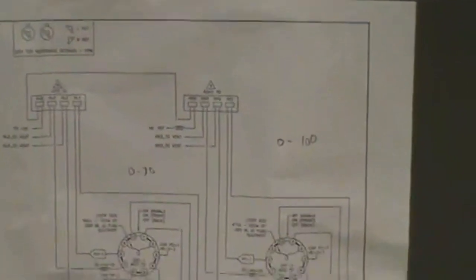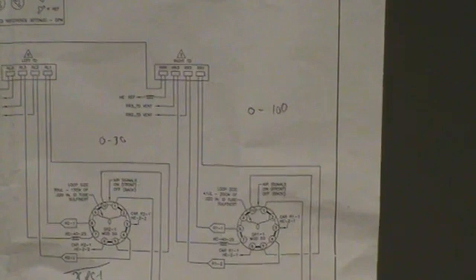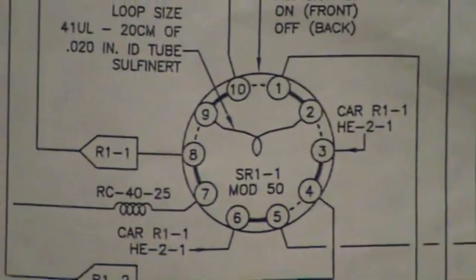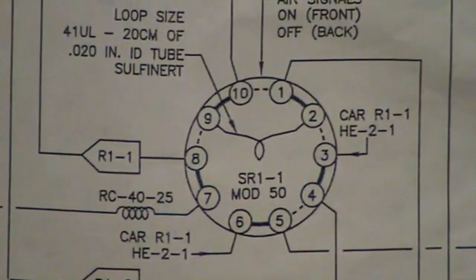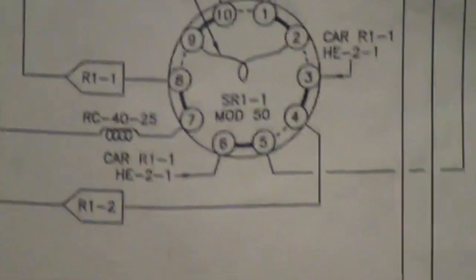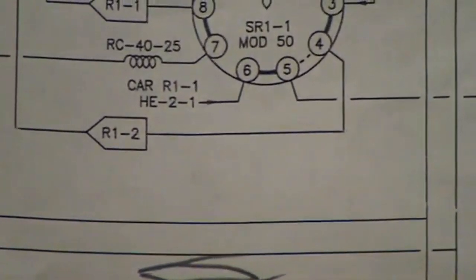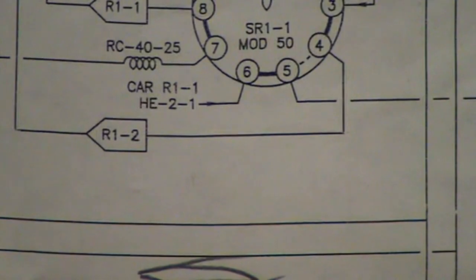Okay, so then after we get our components of interest, they are going to wrap around. They're going to come in on 5. We're still in the on position. Go to 4. And then the components of interest will make it over to column number 2, which is the main column to be separated out. If they're super lights, they will just fly through and go on to the main detector and not be measured. The components of interest will be separated out and measured.